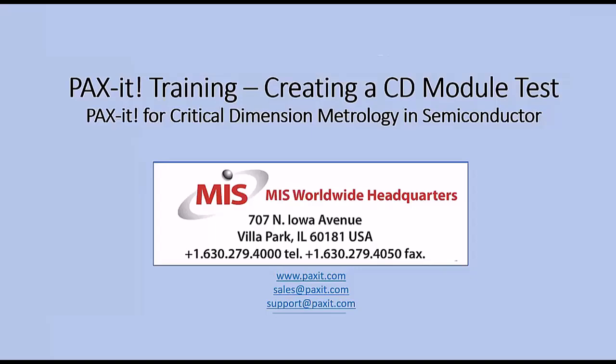Hello, and welcome to our instructional series on PAX-it Image Analysis and Metrology. In this video, we will cover the basic steps to create a saved test using the PAX-it CD module, a tool commonly used in the semiconductor photolithography lab for maintaining process control through a wafer lot.